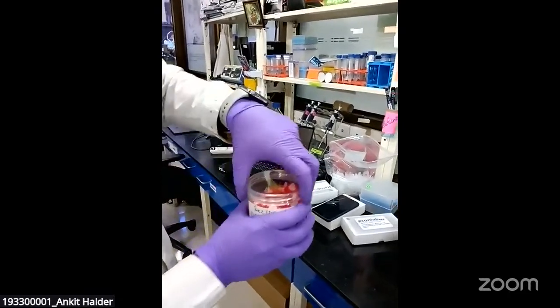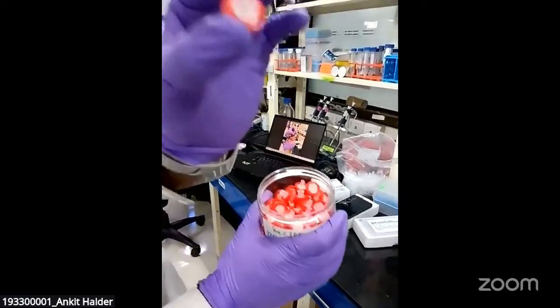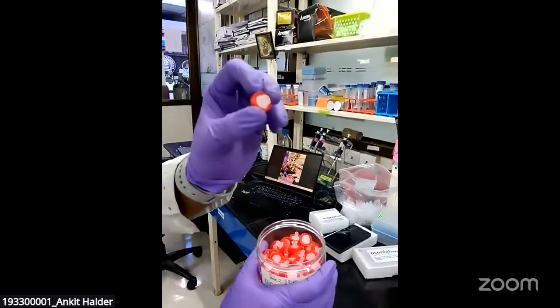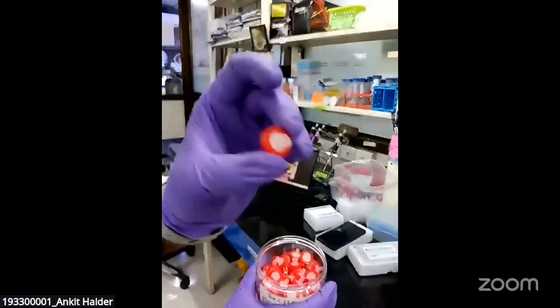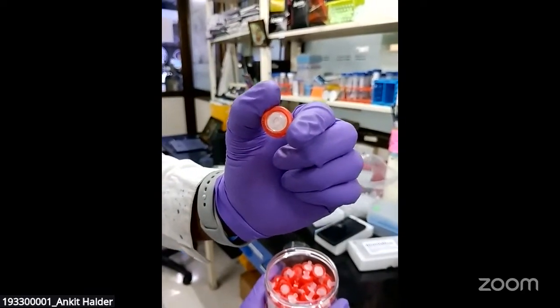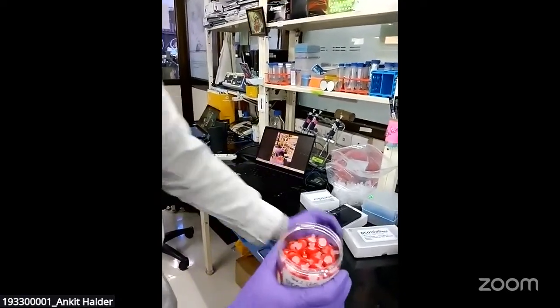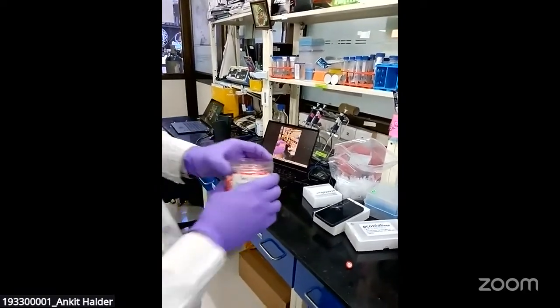If you closely see, this is the filter you can see. Every time after processing the sample, when you are going to analyze or give the sample to the mass spec, you need to first pass the samples through it. You can see the diameter is 0.22 micrometer. After it has passed through this filter, your samples are ready for the injection, for the data acquisition.